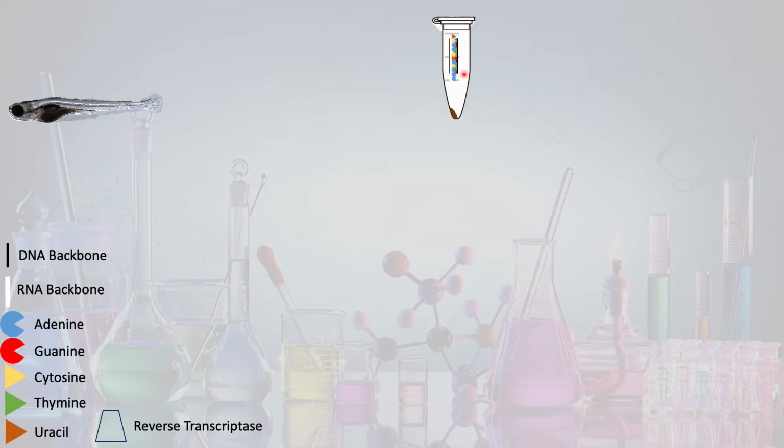So our first step in purifying and analyzing our gene of interest is to select for our messenger RNA. So we do this by applying a primer set that's going to set up for our oligo dT.